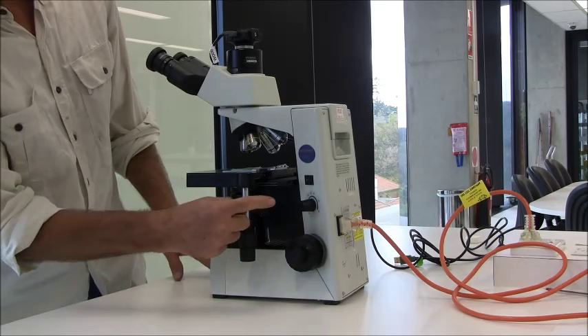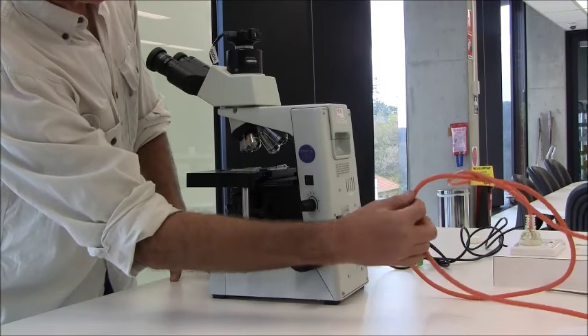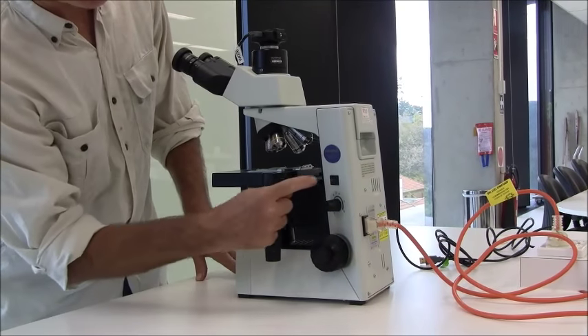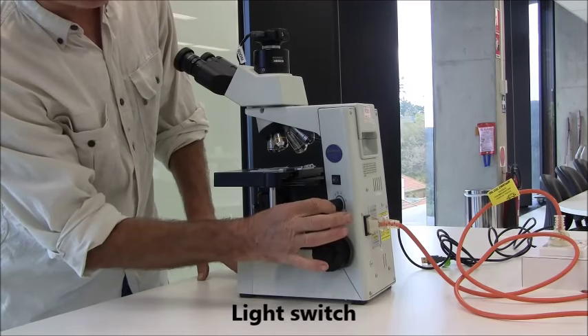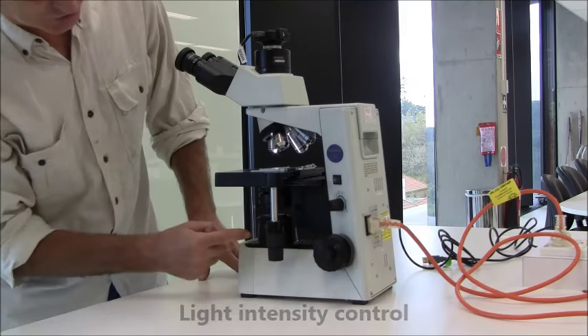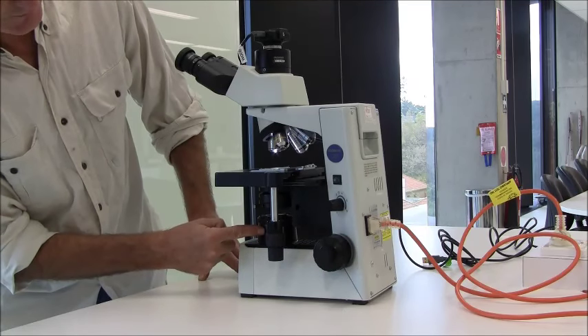The first set of controls I'll show you is the light. You plug the light in with the mains cord, switch it on at the power, and here is the light switch. The dial beneath it is the light intensity, adjusting the single light source up here underneath the stage.